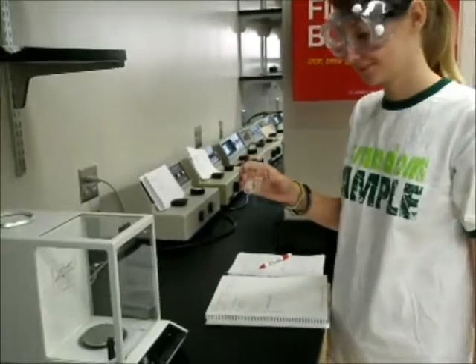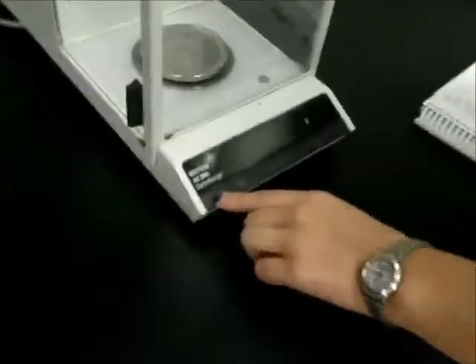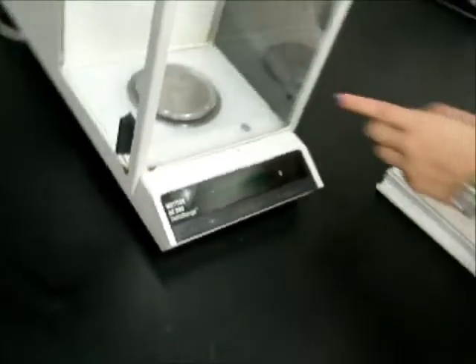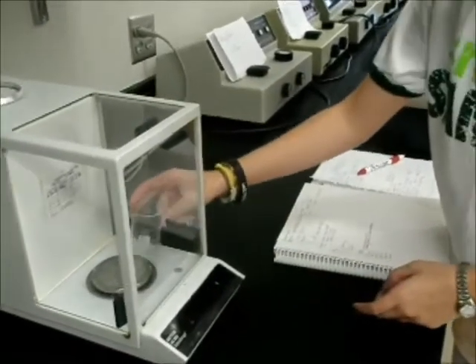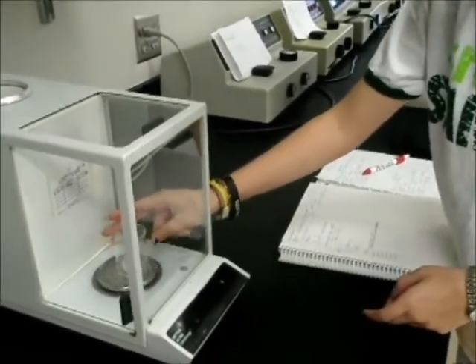Jessica starts out by taring the balance and finding out the mass of the beaker. Notice how she gently places the beaker in the balance and closes its doors. The beaker measured 36.62 grams, which should be reported in the notebook.